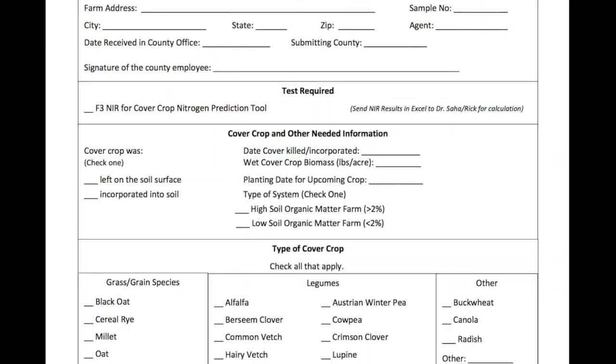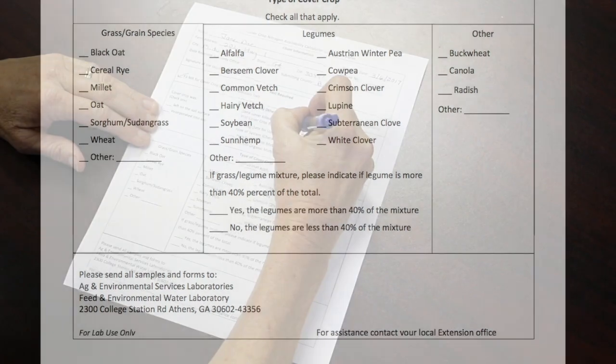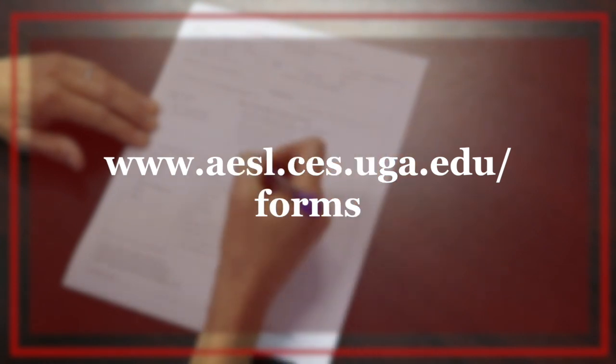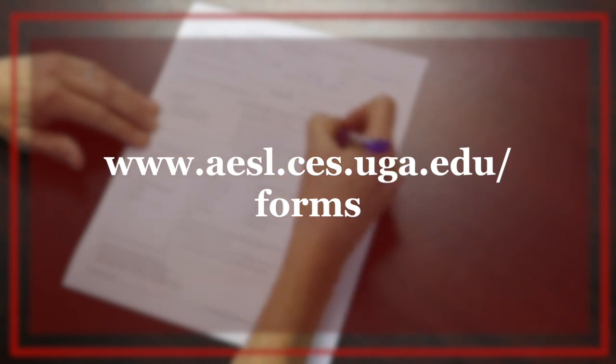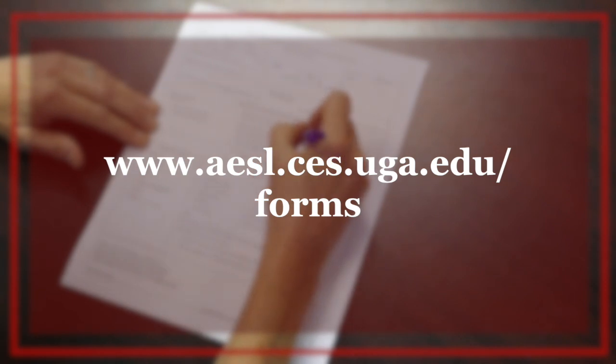Send the sample with a submission form to the Agricultural and Environmental Services Laboratories at UGA. The submission forms are available online at www.aesl.ces.uga.edu.